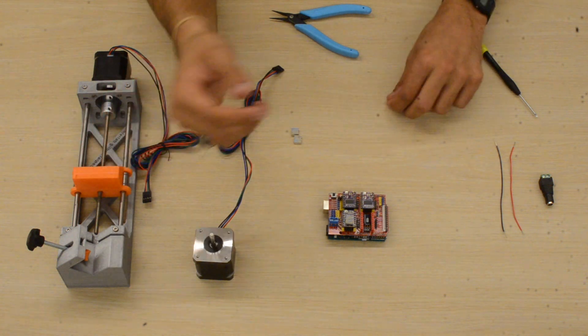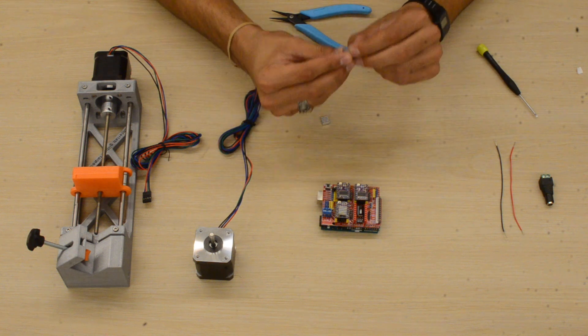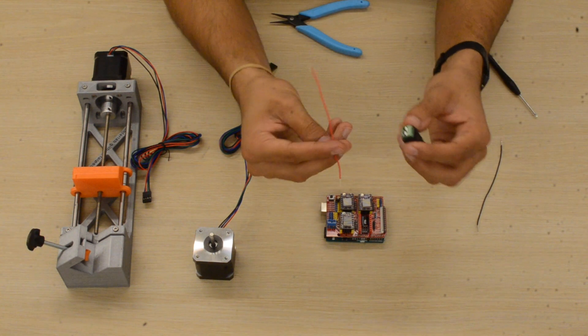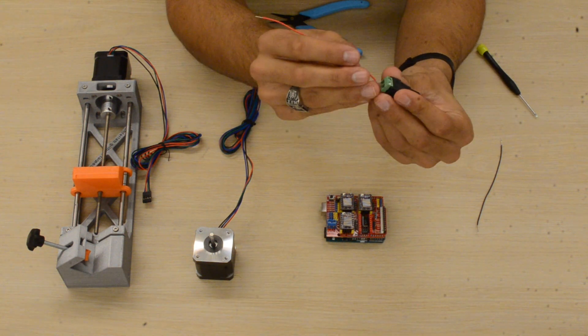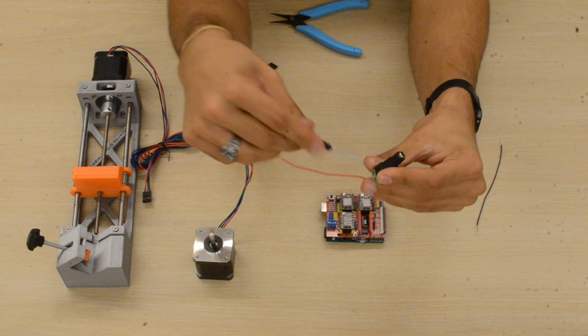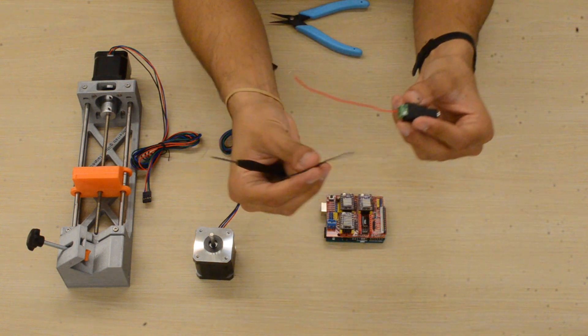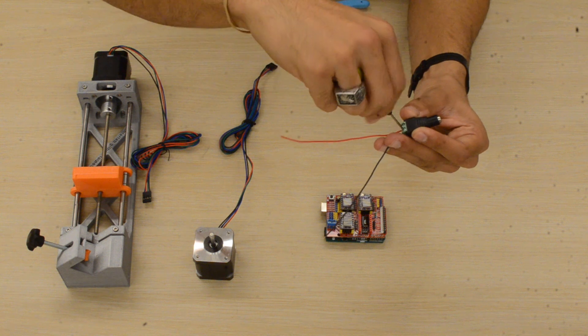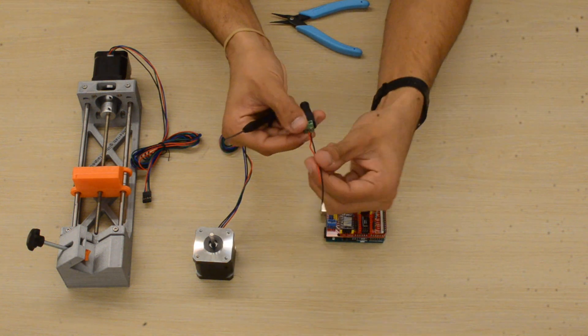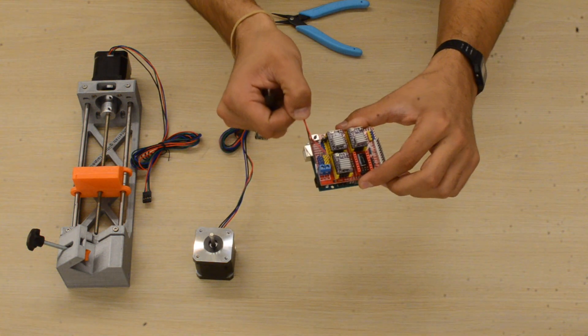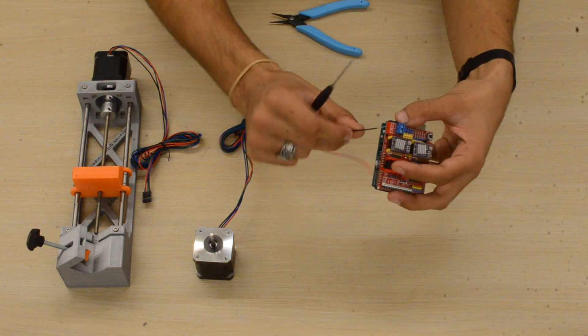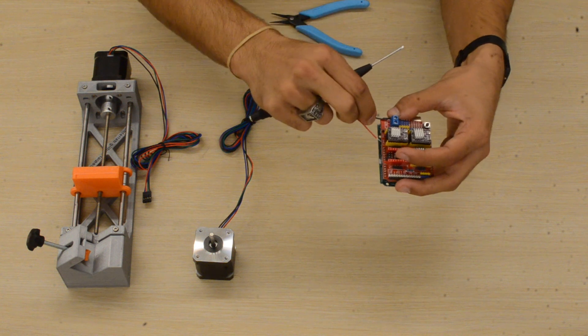Once that's done, grab the power connector and plug the red wire into the plus side of the power connector. Stick it in and tighten down the screw—I'm using a flathead screwdriver to clamp down on the wire. Do the same for the minus side. Then plug those wires into the associated plus and minus sides on the CNC shield: red goes into plus, black goes into minus. Stick it in and tighten it down.